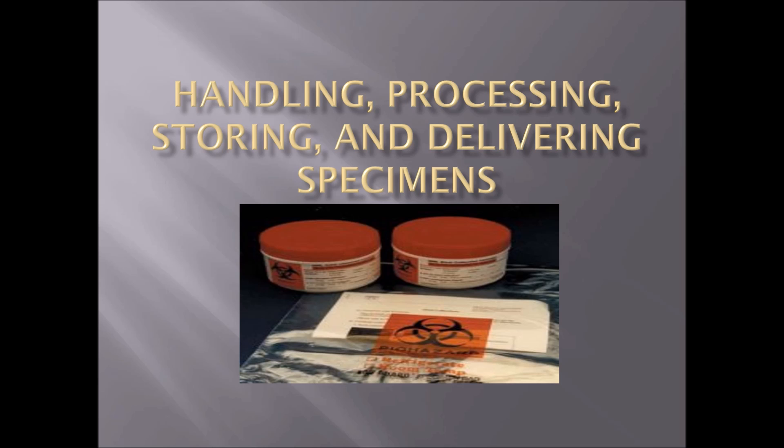In this section of Volume 4, we're going to be talking about handling, processing, storing, and delivering specimens.